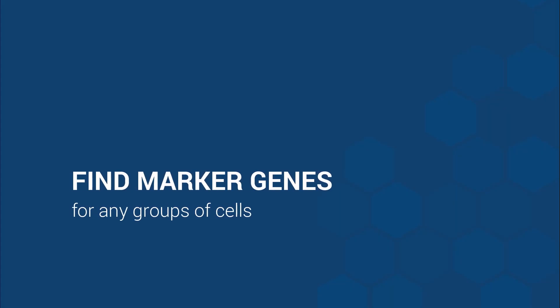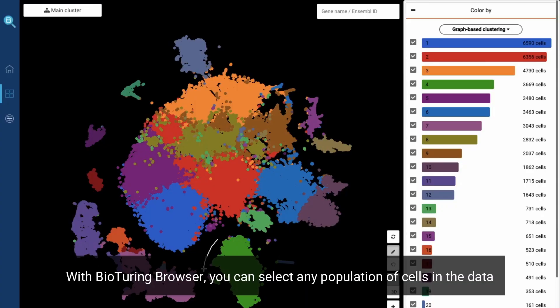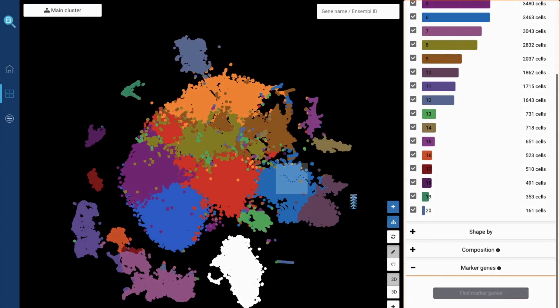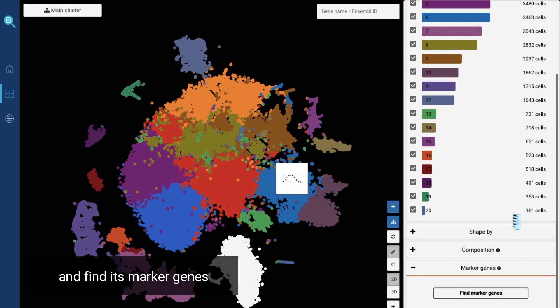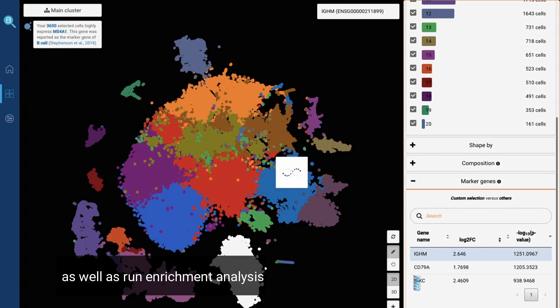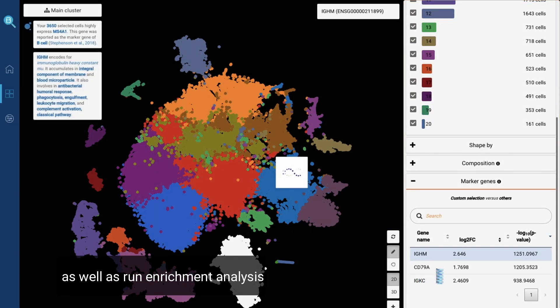Find marker genes and run enrichment analysis. With BioTuring Browser, you can select any population of cells in the data and find its marker genes, as well as run enrichment analysis.